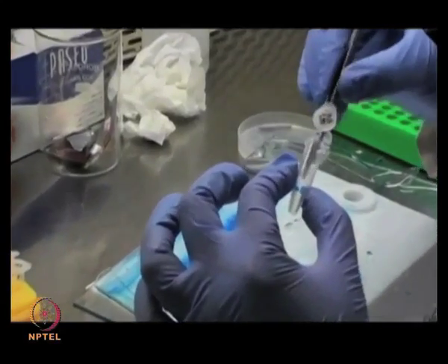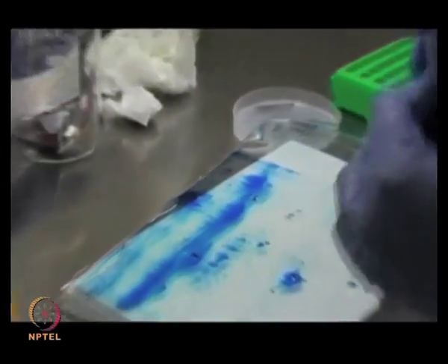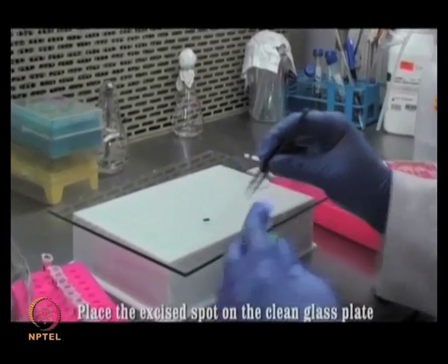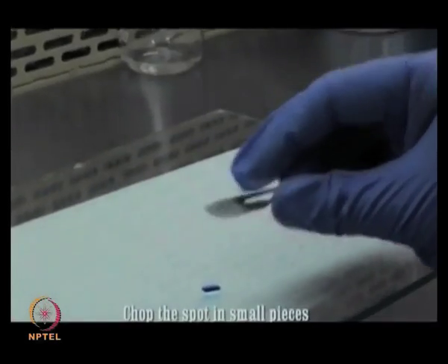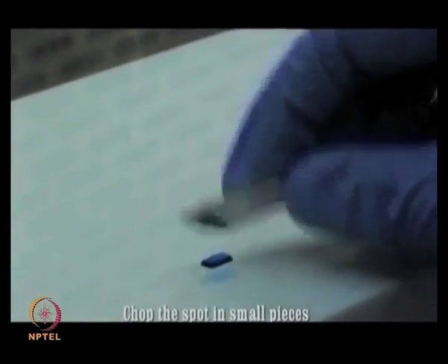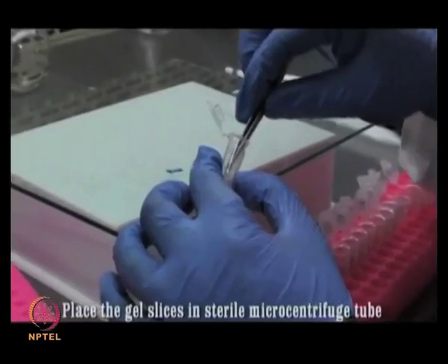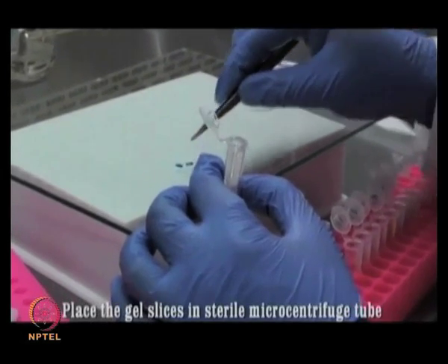It is possible you have excised a large spot or large band, then cut the slice into cubes while avoiding too small pieces as they can clog the pipette tips. So, this is the larger spot. You cannot directly take this one for doing the in-gel digestion. So, you need to cut that into small cubes. Now, keep these small gel pieces into a sterile microcentrifuge tube.